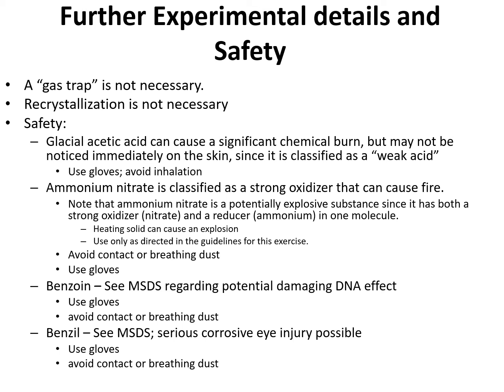For that we have to follow the experimental procedures strictly, especially when working with ammonium nitrate. Any contamination with this chemical is not safe, so we can avoid contact by wearing gloves at all times in the lab. And of course, as much as possible, we have to avoid inhaling the dust from ammonium nitrate, as well as from any dusts, including the product benzil.